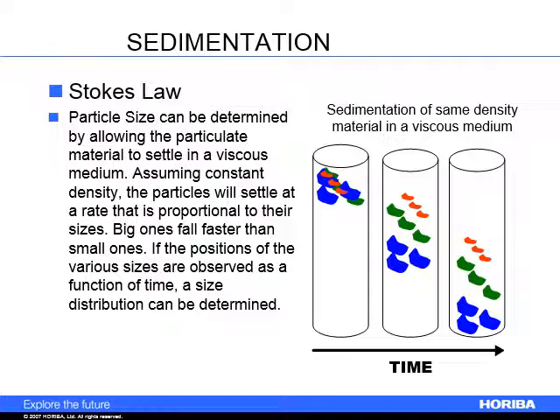And there are systems that combine this type of sedimentation with laser or X-ray to give you a measurement of a particle as it falls through. Not super common, but it does work and it is an option. You will encounter this from time to time.